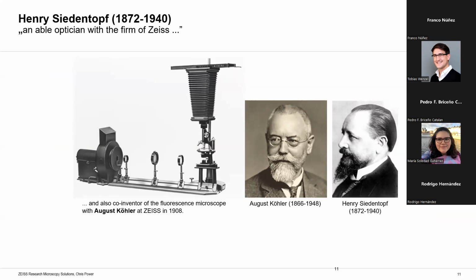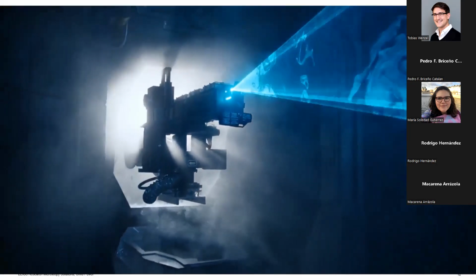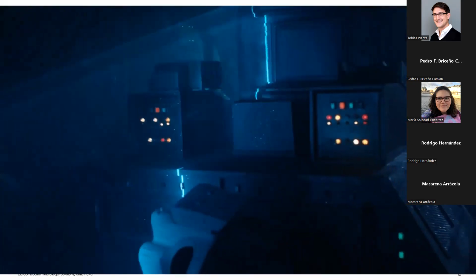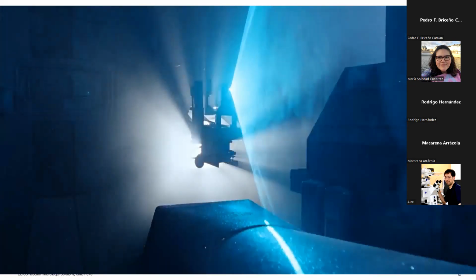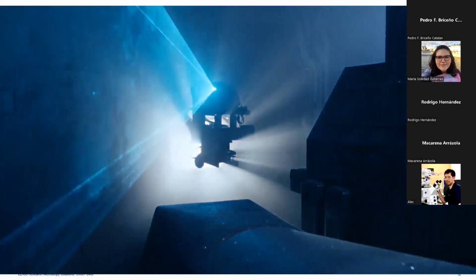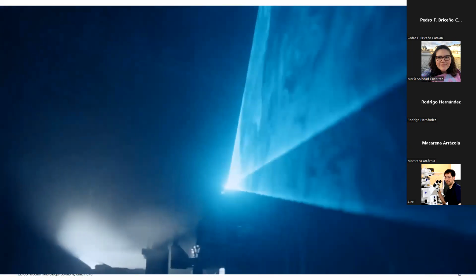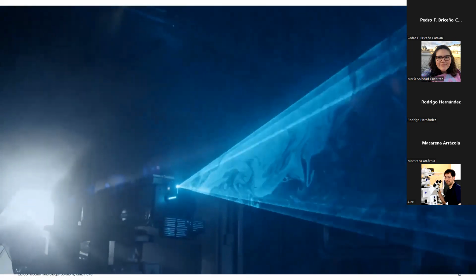So you build a ship. How do you know that the metal along the hull is correct? And Ridley Scott grew up on the shipyard. So many, many years later, he mentioned to James Cameron, when he made the film Aliens, this is now in like 1986, this trivia about if you run a light sheet along a solid object, you can get a really good feel for the structure of the object. So as far as I know, this was the first mention of light sheet in a film, in Aliens in '86. But all this time it had been forgotten in the world of microscopy.